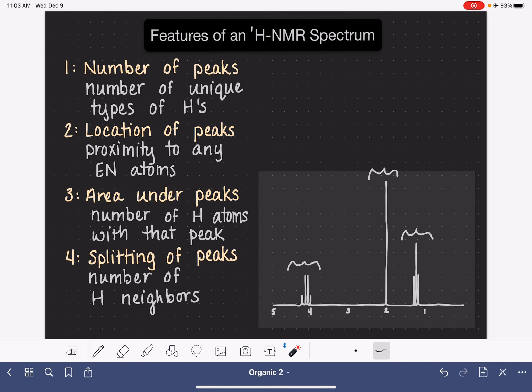The splitting of the peak refers to whether or not each individual peak is shown as just one single line, or it divides itself into some smaller lines as well. So this peak right here, we can see because it has four different spikes on it, we see that this thing has been split into four.